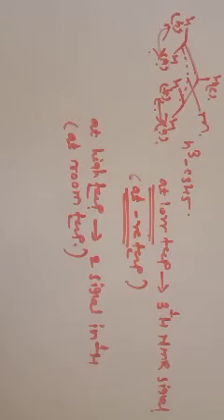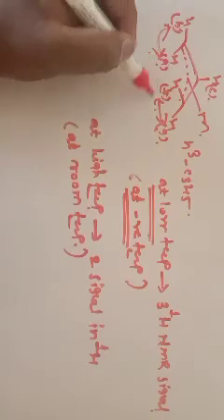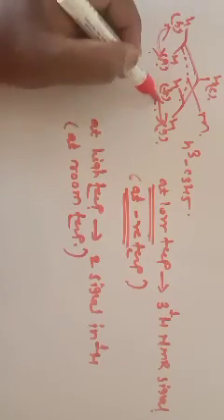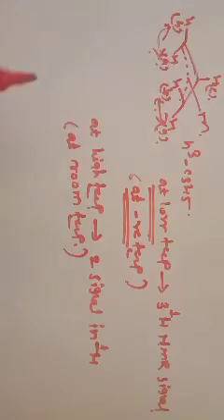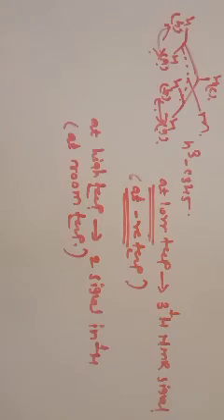So there is a rapid exchange of the AB protons, and the NMR instrument cannot detect this exchange, and therefore for all these four protons, this AB and this AB proton, we get only one signal, and for this C type of proton we get one signal.